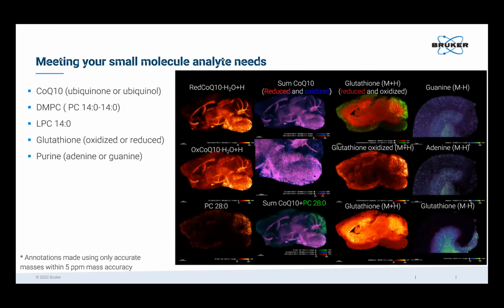Okay, so let's go back to some pictures. So that's how you do the experiment and the basics of what's possible with our software and add-ons. So here's a small selection of small molecule analyses. So this was done recently for a pharma customer who was interested in the redox pathways. And so I just pulled out a handful of the molecules that are accessible and that are able to be imaged within that space.